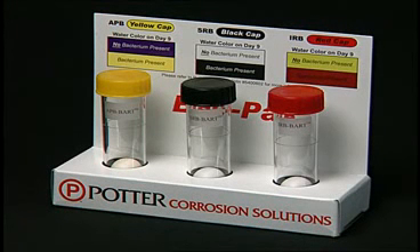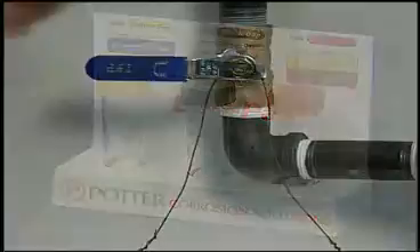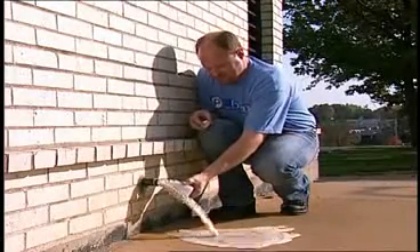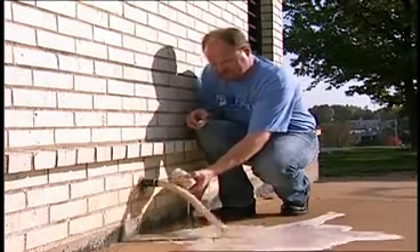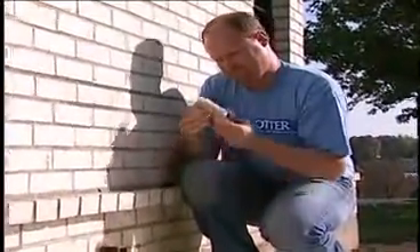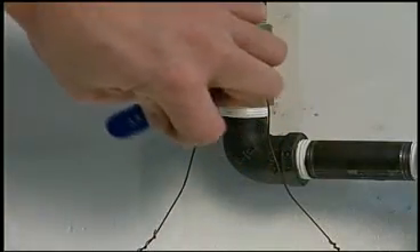Here is how to use the Potter Backpack Test Kit. Start by running the water source to be tested for approximately 15 seconds. Remove the cap on the 120 cc bottle and fill it, then replace the cap. Shut off the water.